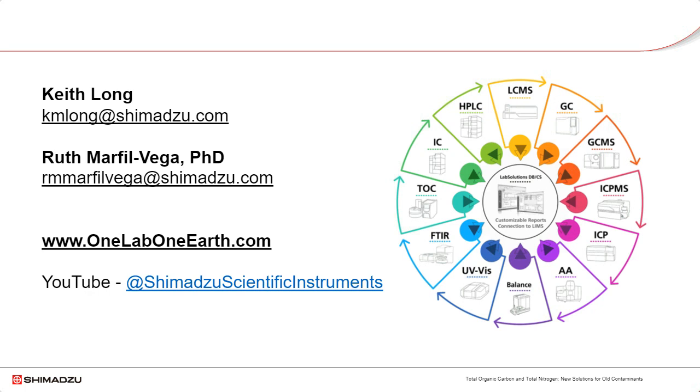Thank you, Keith. Suddenly there were a lot of questions that popped up on my screen at the same time, so I'm double checking that we are not repeating topics. Oh yeah, what's the concentration of halogens in the samples, or what's the maximum concentration of halogen in the samples before having to use the scrubber?